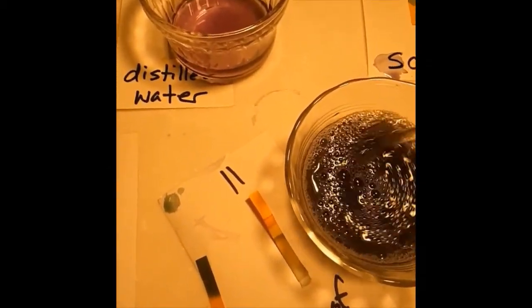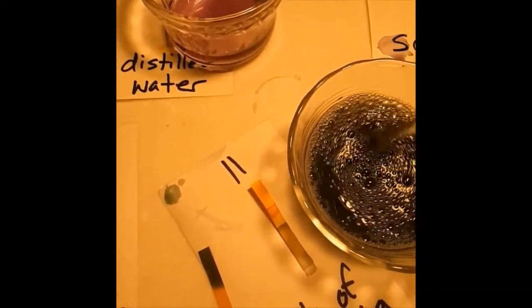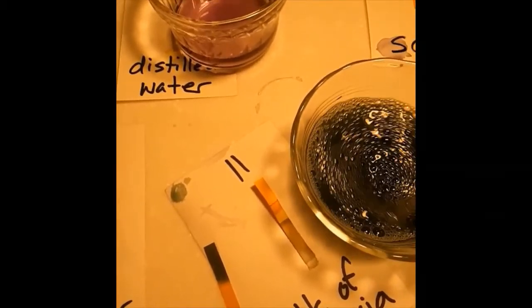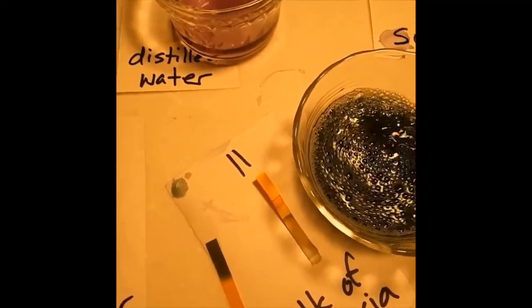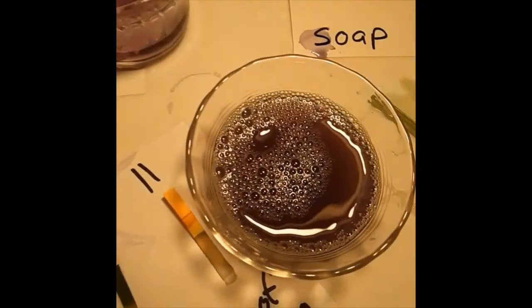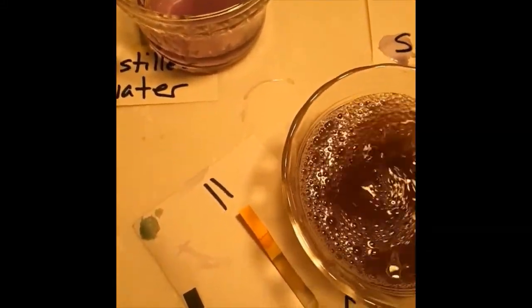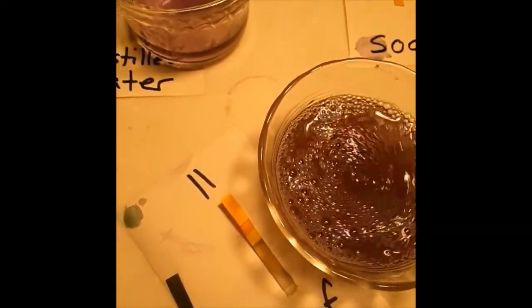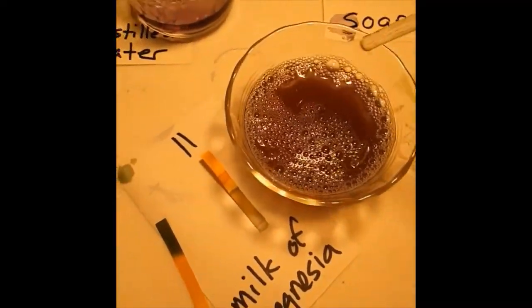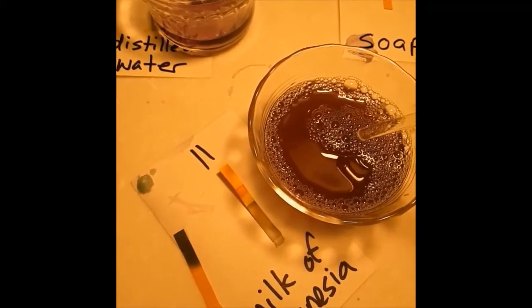Let's try blue again. Perfect. And blue. And probably green again. It's less green. No, it's still green. Anyway, we're going to need a lot. There we go. There. Okay. I swear to God, that's it, right? Okay, it is purple. It's staying purple. I think we did it.